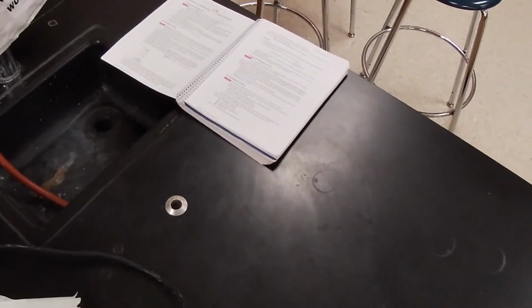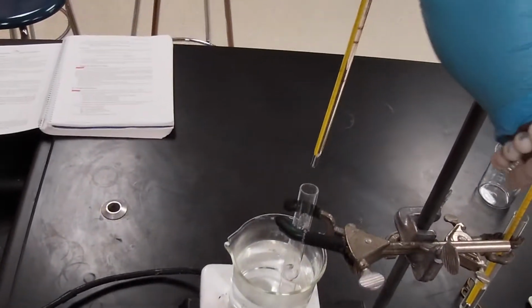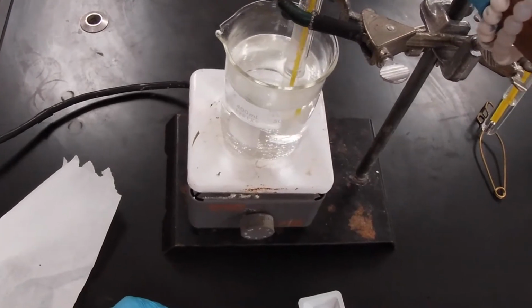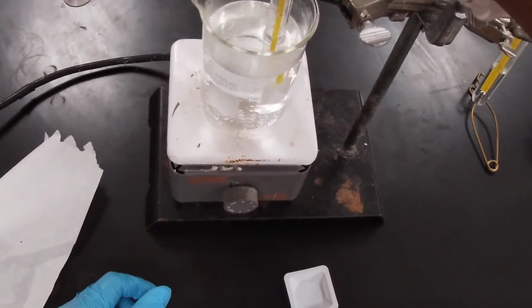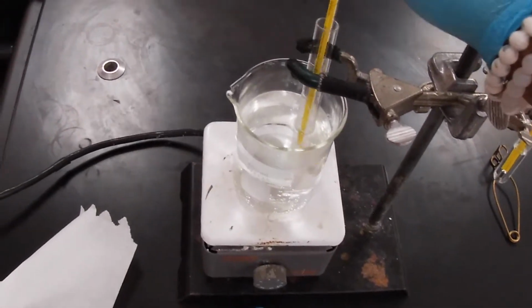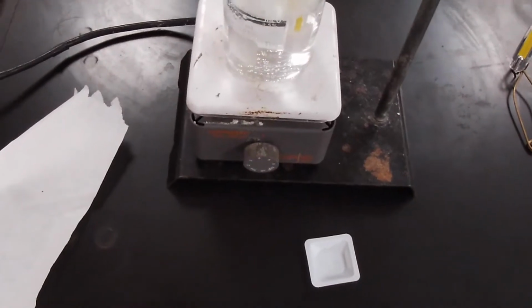All right. Now go ahead and lift it up. So here we have submerged our potassium nitrate, and we're gonna stir and heat, and pay attention over here as well. All right, I'm gonna increase the heat a little bit. And there we go. So that's our 4 gram.